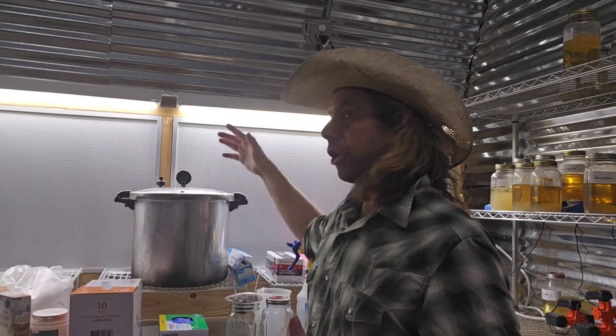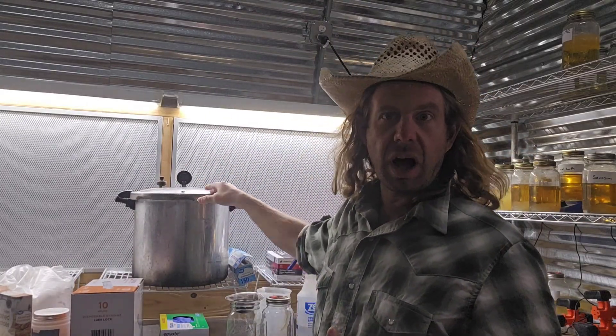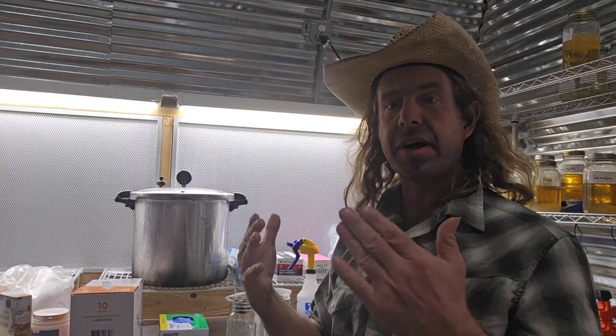Next up, number two: a basic pressure cooker. A basic pressure cooker or an autoclave — you can use either one. You're going to need this to sterilize any growing medium, any liquid cultures, any agar, any tools, stuff like that. So you're going to need a pressure cooker or an autoclave.